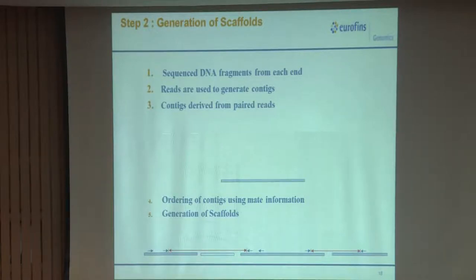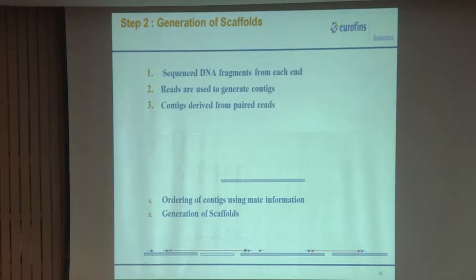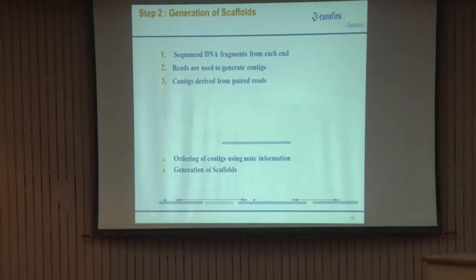So it's all a jugglery of the best and most productive softwares, as well as a jugglery of the different platforms. Right, exactly. A single one may not give you the complete picture. But for smaller genomes like bacteria, you can go with one single platform. Complexity is also less. But if you're going for fungus and other eukaryotic genomes, you need different platforms and different softwares to bring out the assembly. Or else you need to optimize it.